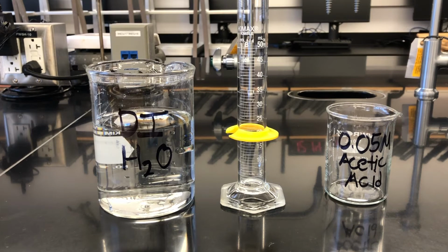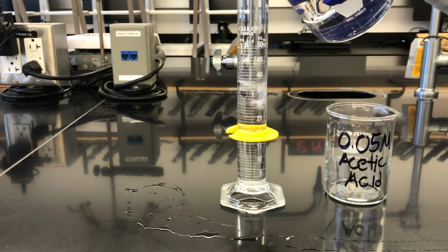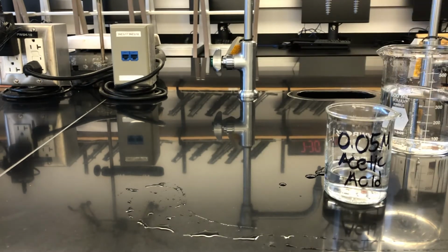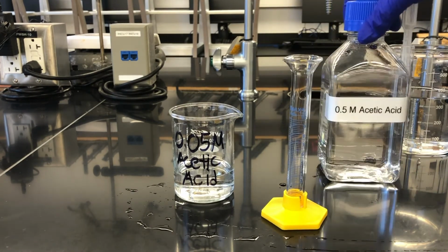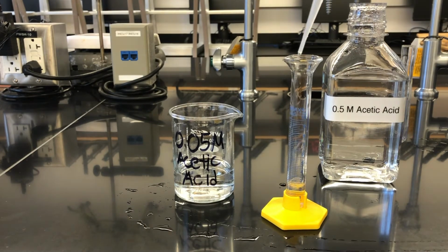To start Part B, we prepare 50 milliliters of a 0.05 molar acetic acid solution from a 0.5 molar stock solution. Using a graduated cylinder, we measure out 45 milliliters of deionized water into a clean 150 milliliter beaker, and then measure out 5 milliliters of 0.5 molar acetic acid and add that to the water.